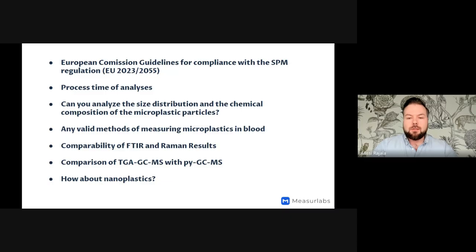Of course, it doesn't give the results in mass in a native way, but usually it's not that important to get the exact number. It's more important to get a general idea, and this method gives basically the worst case scenario.